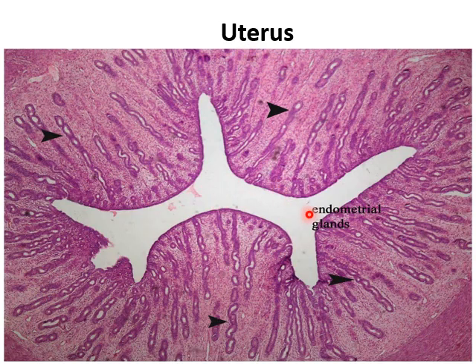A rounded structure with a lumen: we have the uterus. Here, the uterus has a narrow lumen, and the lining epithelium is one layer, simple columnar, partially ciliated. The most prominent thing in the uterus is the presence of the uterine glands. When you inspect the musculosa, the middle layer of the muscle contains many blood vessels. The inner and outer layers are longitudinal, and the middle layer is circular and oblique, containing many blood vessels.